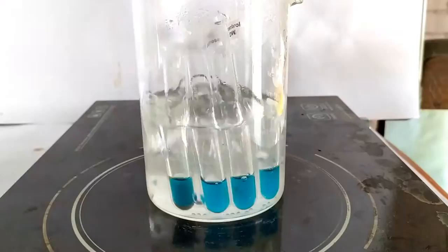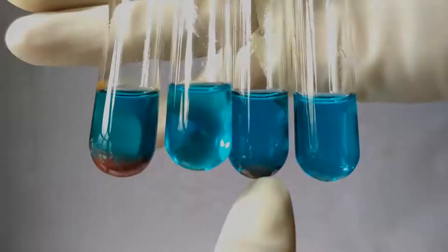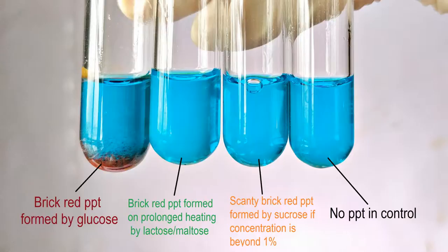We can see that the tube containing the reducing monosaccharides forms a brick red precipitate during the 2 minutes of boiling. The tube containing the non-reducing disaccharide also forms scanty brick red precipitate on prolonged standing. And if the tube containing the reducing disaccharide lactose or maltose is boiled for an additional 10 minutes or so, it also eventually forms a brick red precipitate, as can be seen here. The rest of the tubes do not form any colored precipitates. This demonstrates the use of Barfoed's reagent to detect monosaccharides in a sample, and also its ability to distinguish monosaccharides from reducing disaccharides based on the difference in time taken for the precipitate to develop.